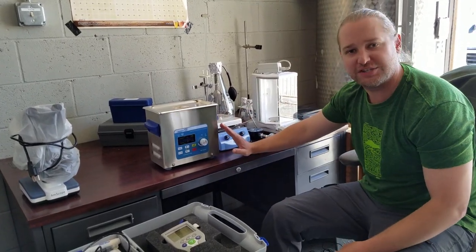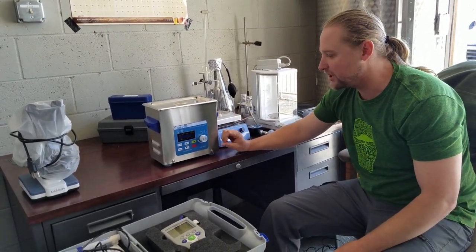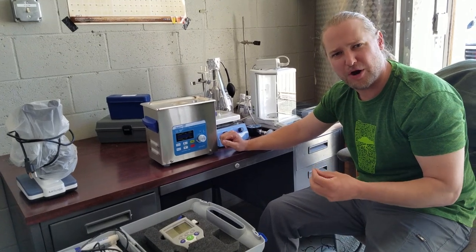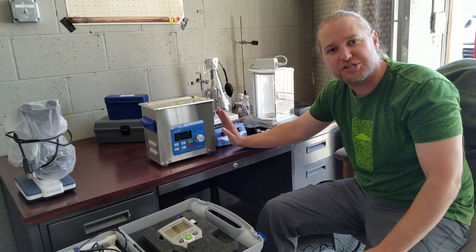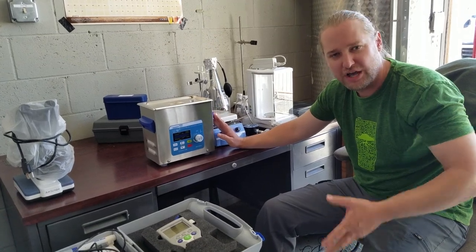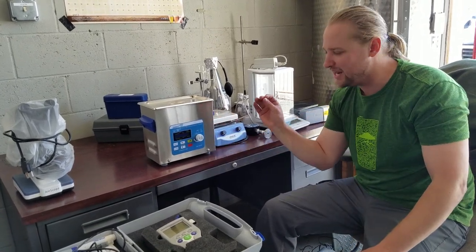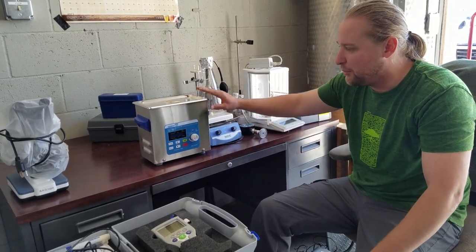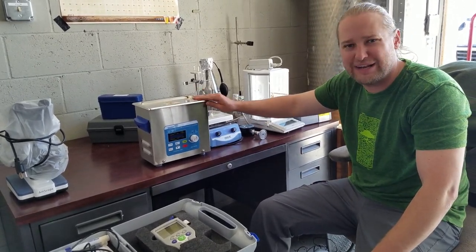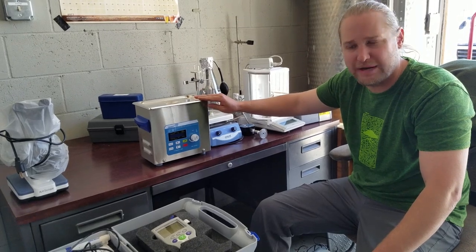This is our ultrasonic cleaner. Cleaning carb stones and really small parts is pretty tough in a brewery, and I'd recommend getting a small ultrasonic cleaner to clean those carbonation and oxygen stones. It uses sound wave bursts to get into those pores and clean them without scrubbing. You should definitely get this if you plan on using carbonation stones.